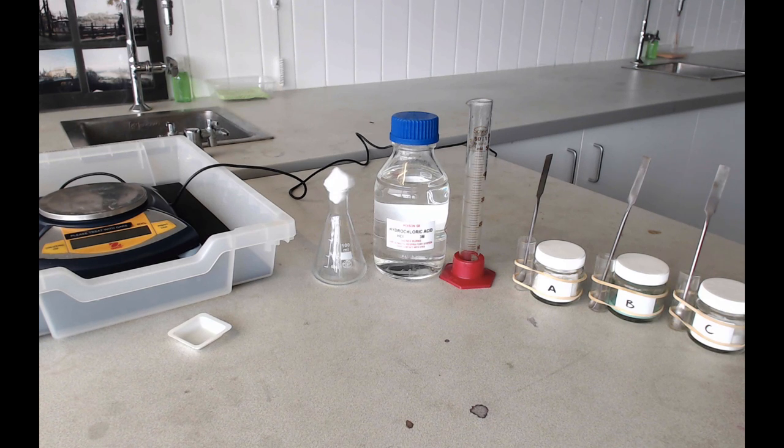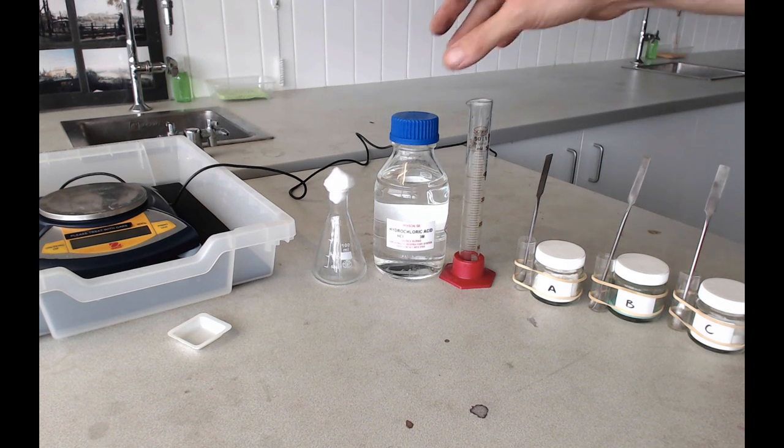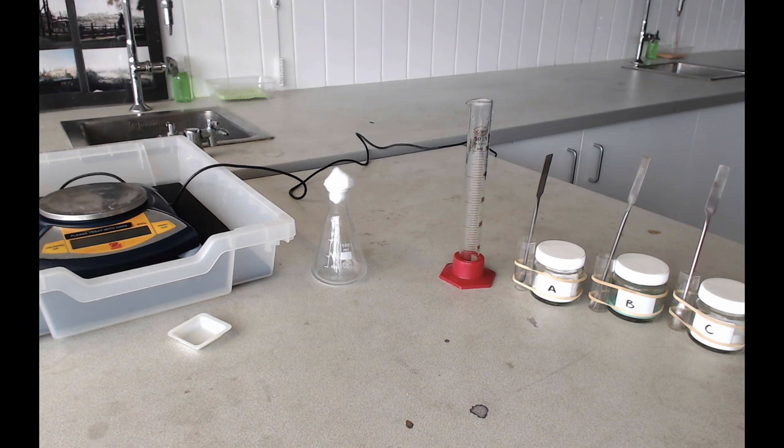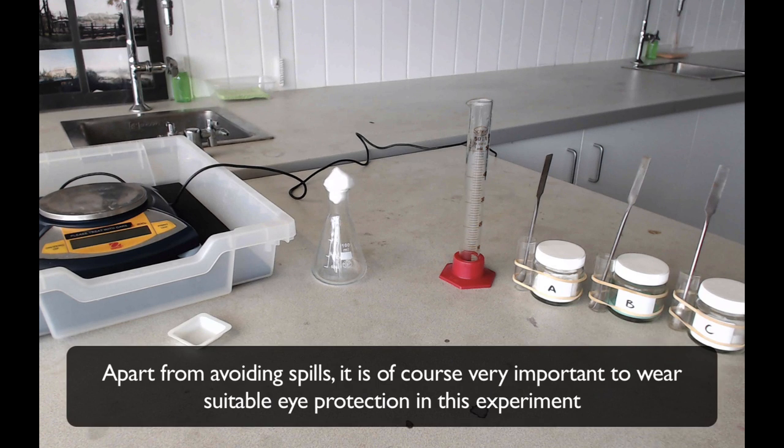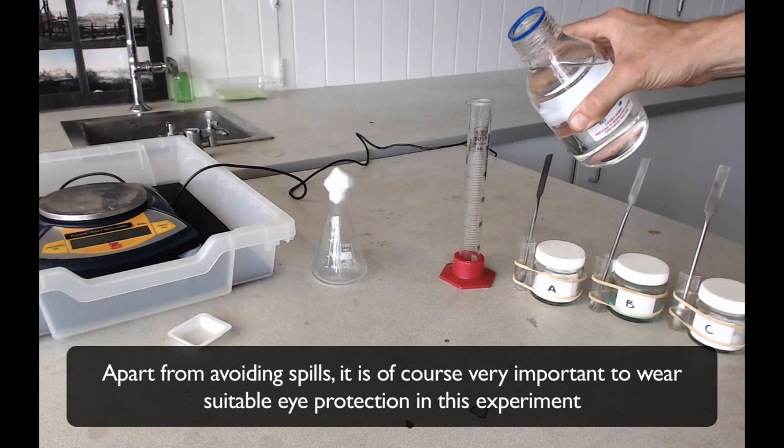The first thing that you're going to need to do is to measure out 20 ml of the 3 molar per liter hydrochloric acid using your measuring cylinder. Now beware with this acid, it is quite concentrated so we're going to try not to spill it, and if we do we're going to make sure that we clean those spills up as quick as we can. Be really careful when you're pouring your acid into your measuring cylinder.